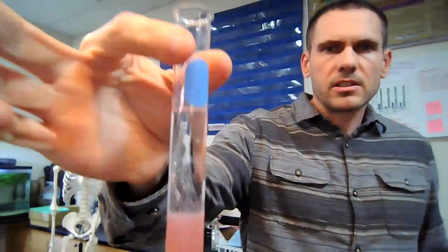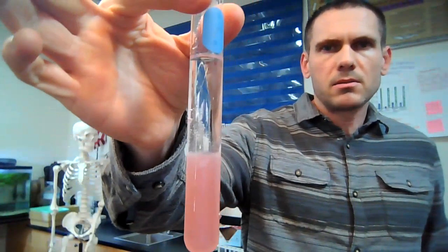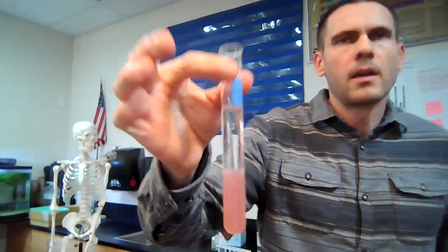You can very clearly see there are 2 layers, right? It looks like they don't even mix. That's weird. What's happening is that the DNA hates alcohol. It hates the rubbing alcohol. It's just like, get away from me, bruh. Just lose it. But the DNA has nowhere else to run except to other DNA molecules. So that's what it does. The DNA just finds itself.